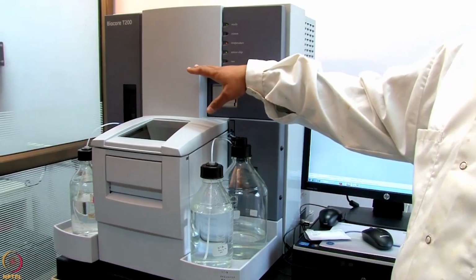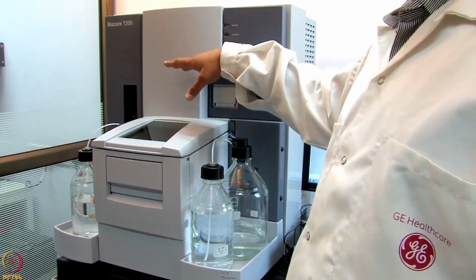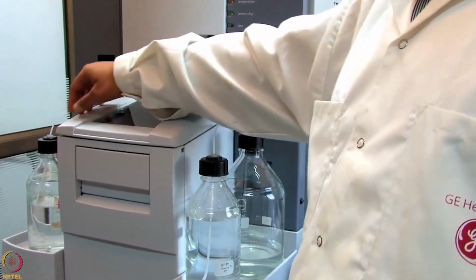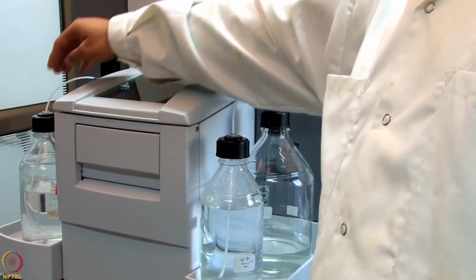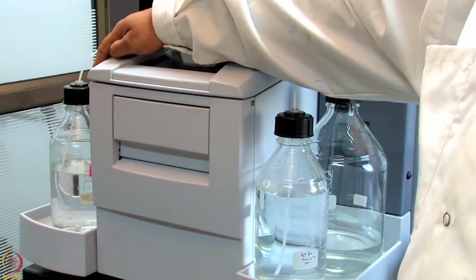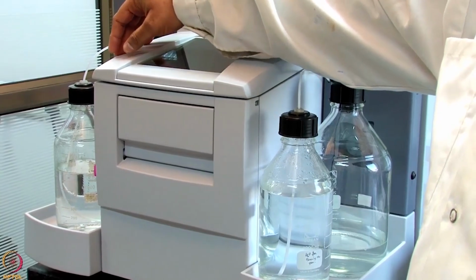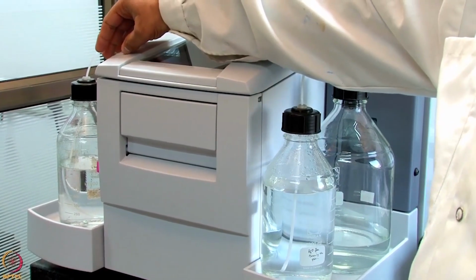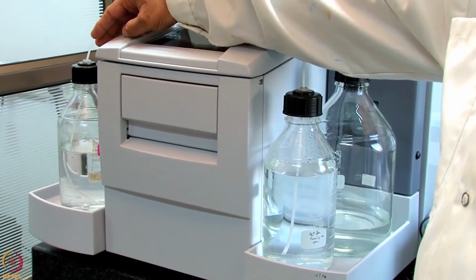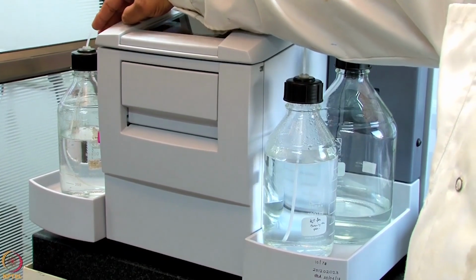So this is a surface plasmon resonance instrument, a Biacore T200. This machine has various parts. The running buffer is connected here, and any of the biological buffers can be connected as a running buffer. They could have any pH from low to high. The regular buffers used in a Biacore experiment are HBS-EP, HBS-N, and PBS for small molecule experiments.